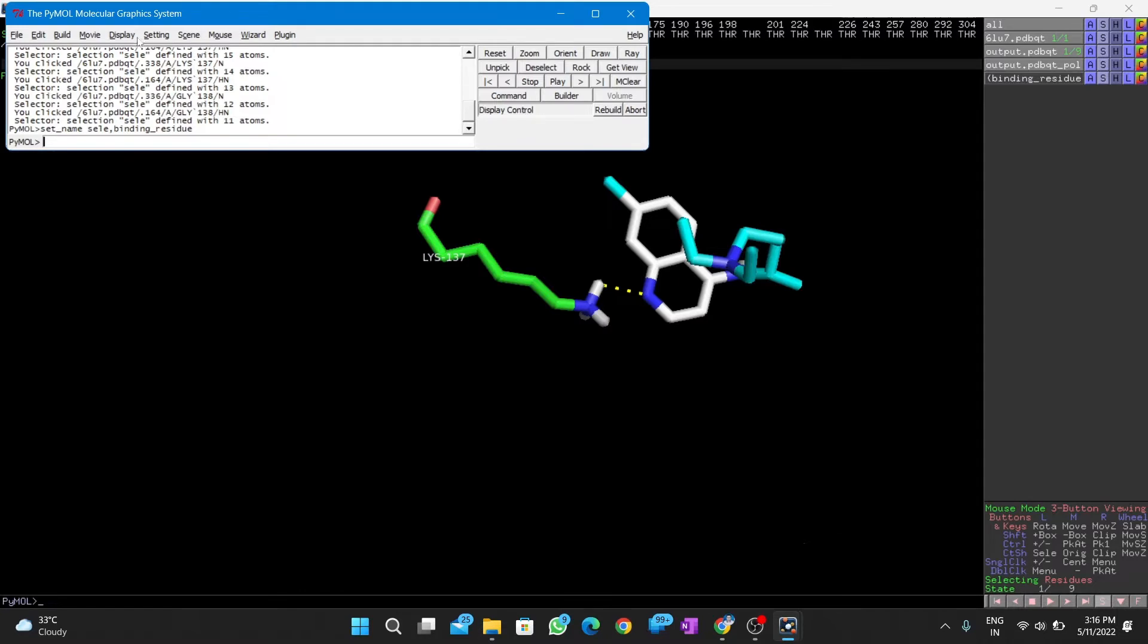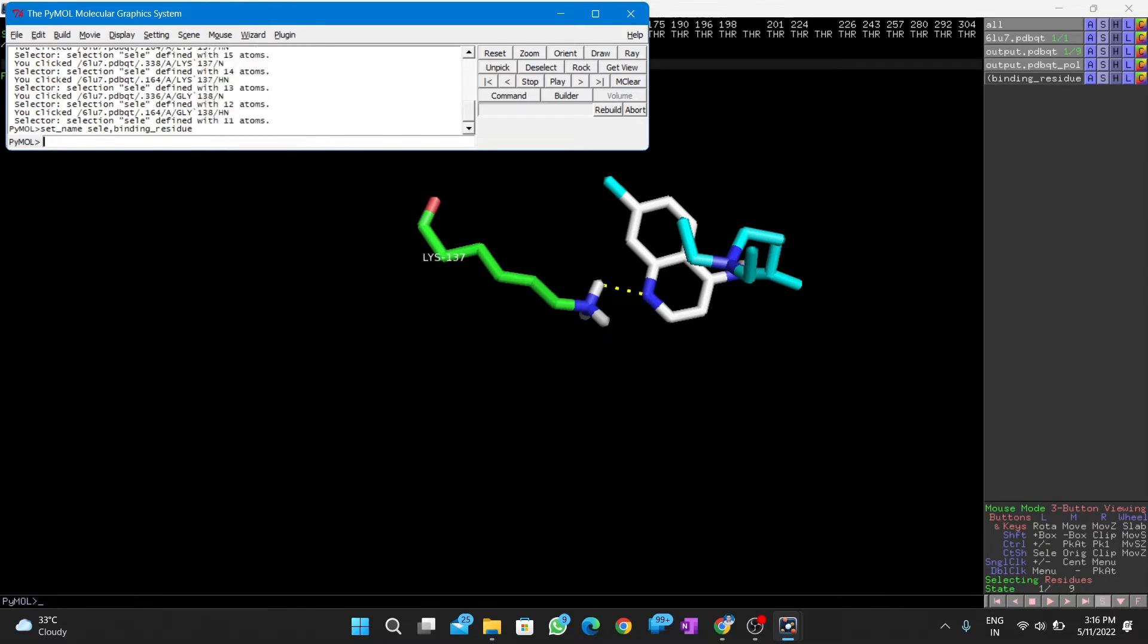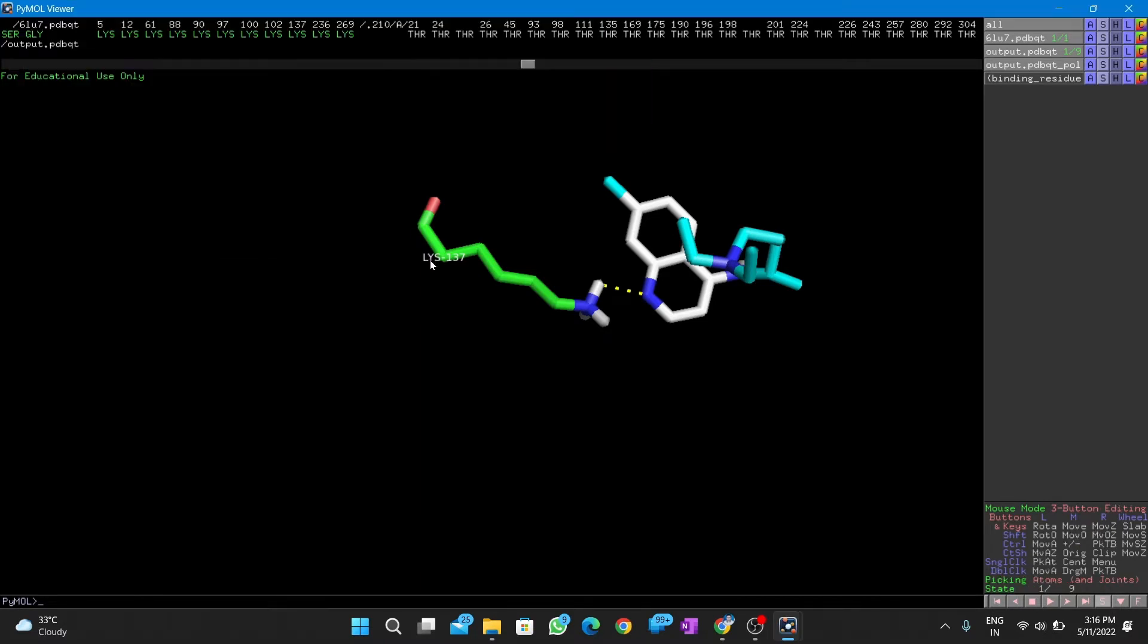Next, we go to wizard and then to measurement. Carefully select the molecules to display the distance of interaction. The value will be in angstrom.